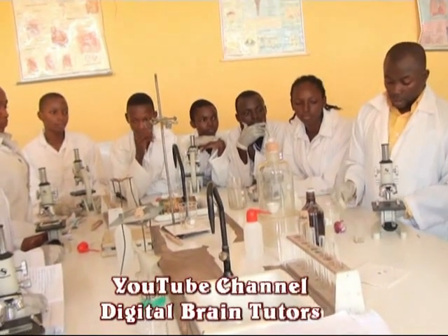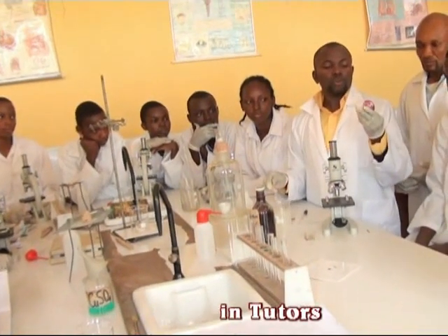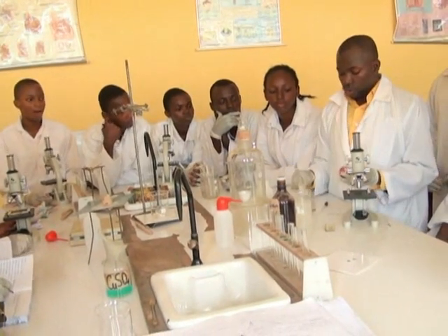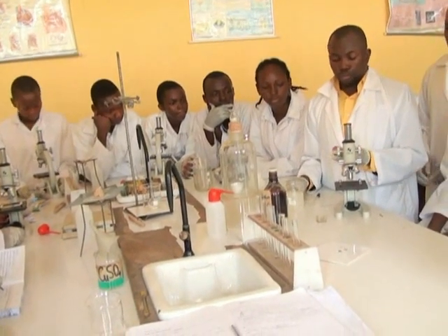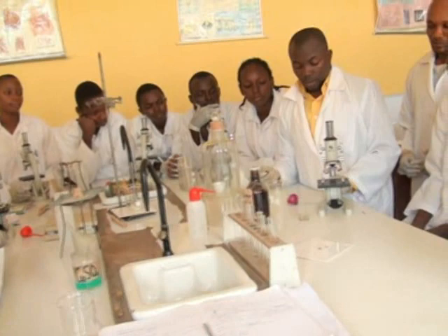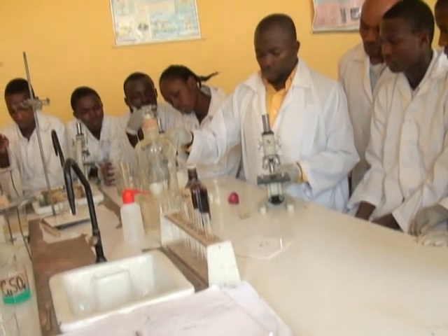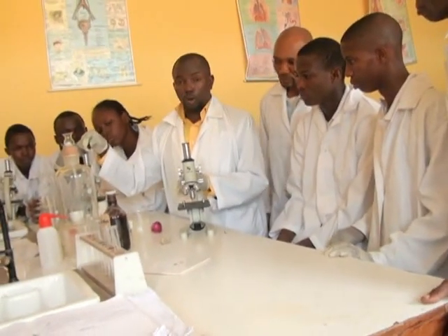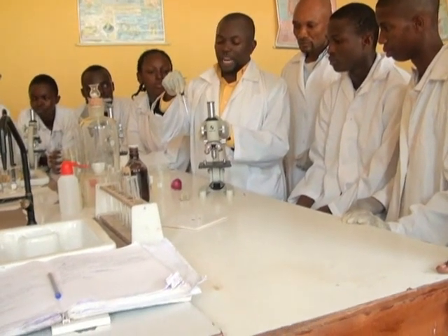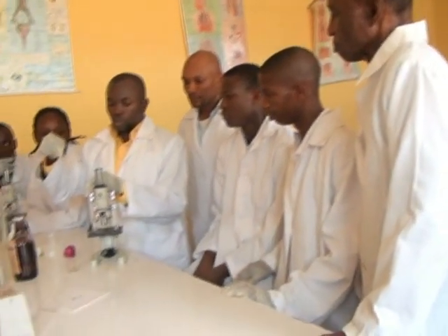So, in order to examine the plant cell, we shall use onion tissue. This is onion tissue, and onion is a plant. So the first process in examining this onion tissue cells is to put a drop of water on the center of the slide. This is called a glass slide. What did I call it? Glass slide. So you put a drop of water on the glass slide.